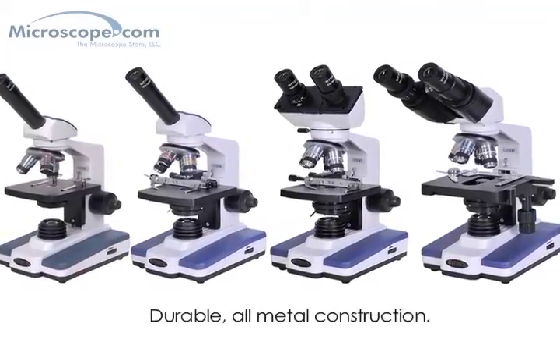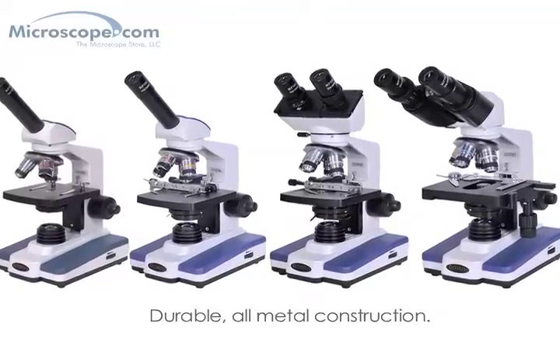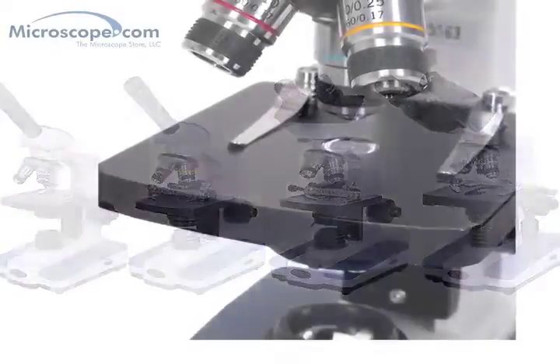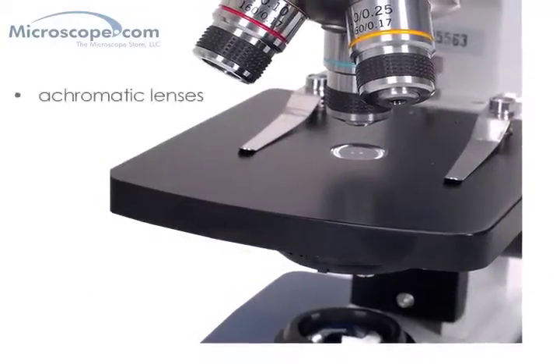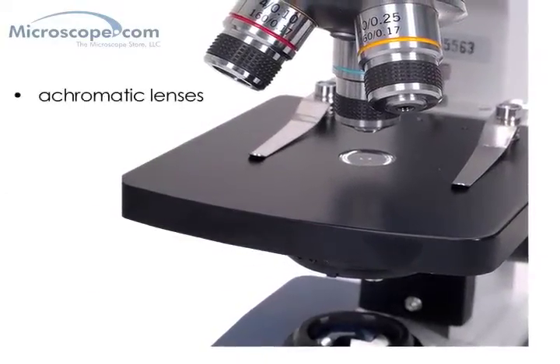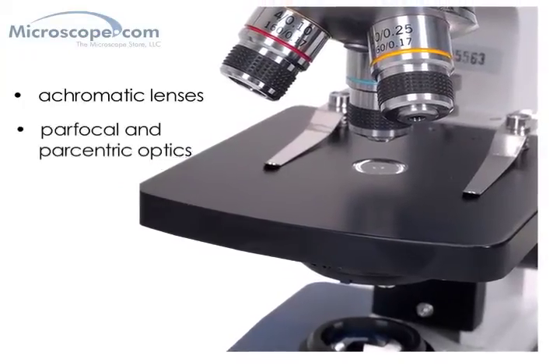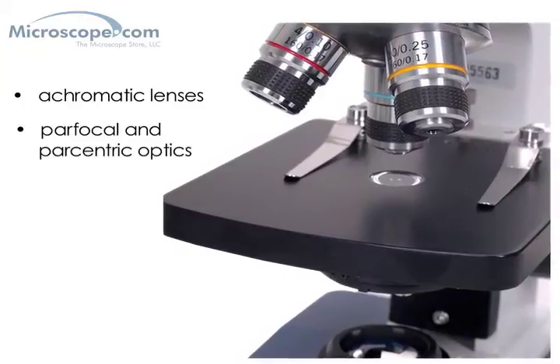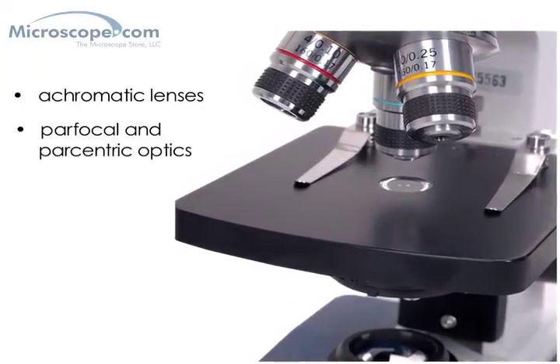These systems are durable due to their all-metal construction and will give consistently reliable operation in the classroom or the home. They have good quality glass optics with coated and color-corrected achromatic lenses, and the optics are parfocal and parcentric, which makes the system much easier to use when changing magnifications since time isn't wasted refocusing and finding your specimen again.